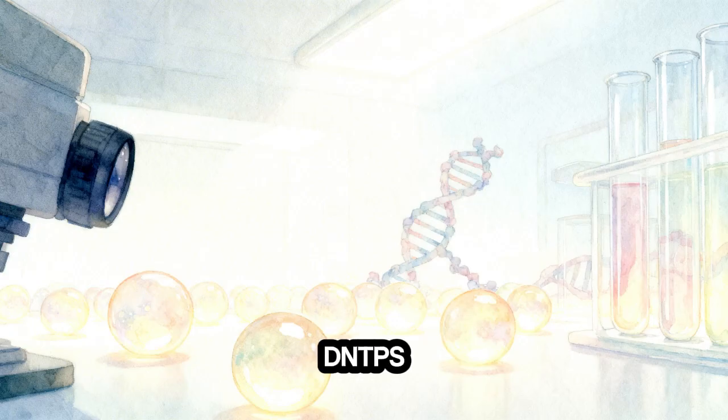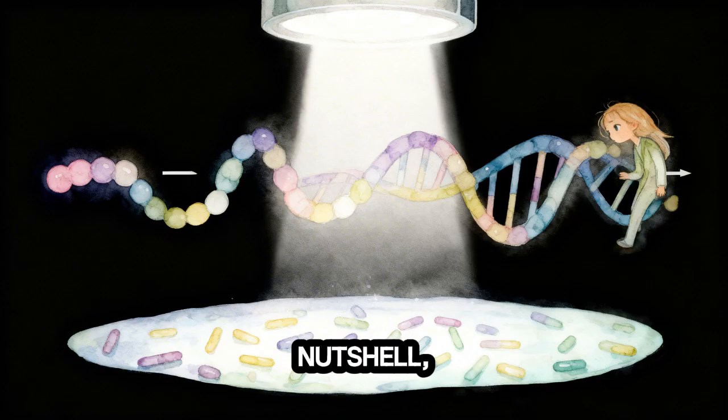We also need dNTPs for synthesis, and for the PCR part, we need the DNA polymerase enzyme. In a nutshell, reverse transcription PCR synthesizes DNA out of RNA, allowing us to generate enough DNA to sequence the genome.